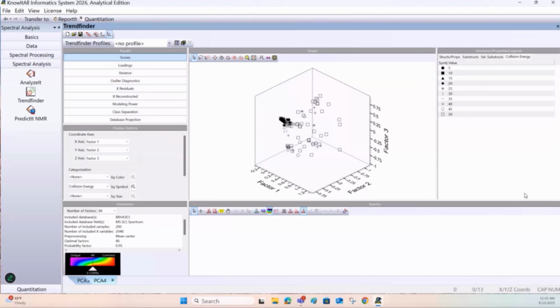Okay, so when I look at this graph, I see lower collision energy spectra clustered together. It doesn't matter what spectrum you have, maybe a totally different compound, but they all look similar. That sounds counterintuitive for chemists, but you think about it. Math only sees 1 peak, 2 peaks, or 3 peaks. So they all look similar.